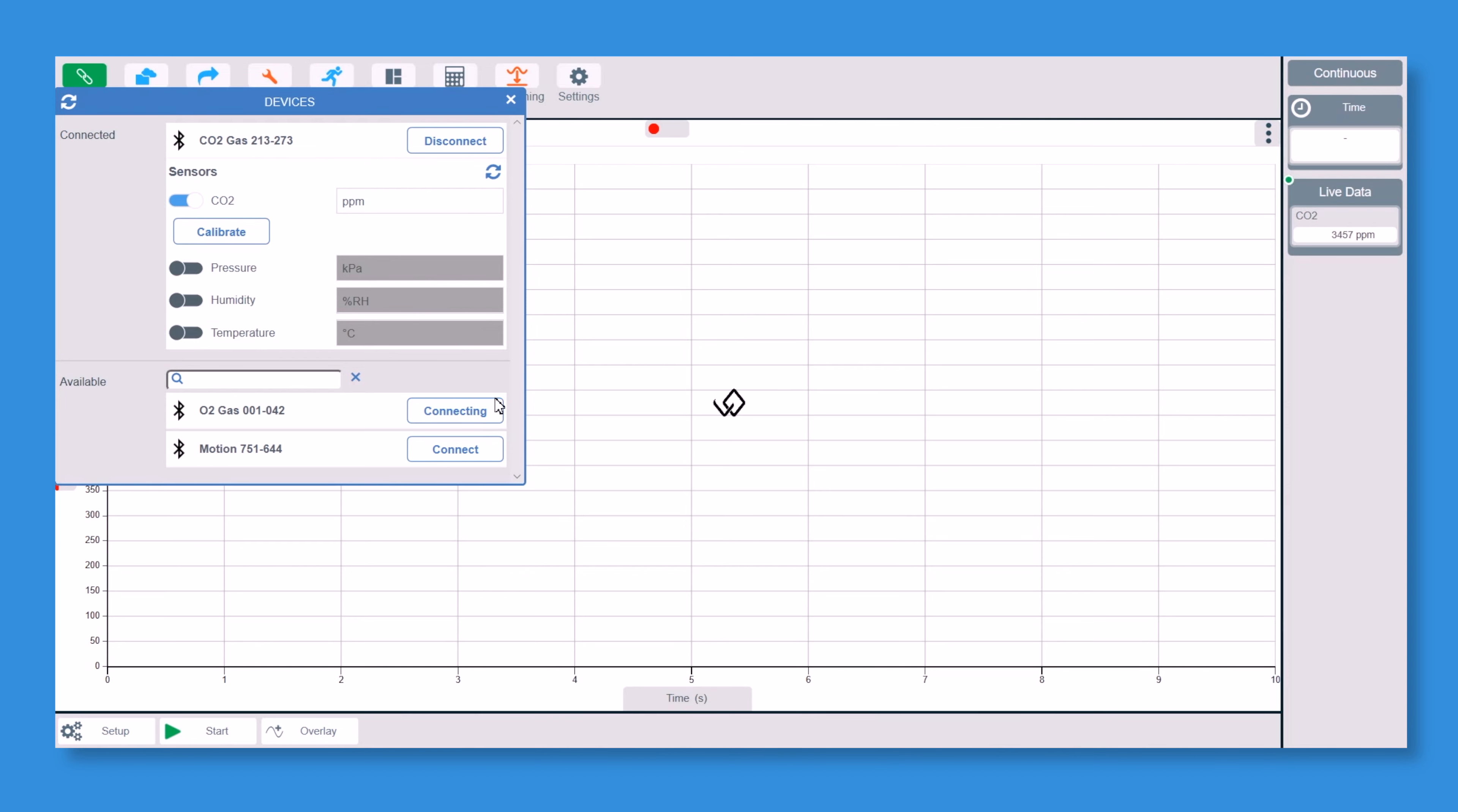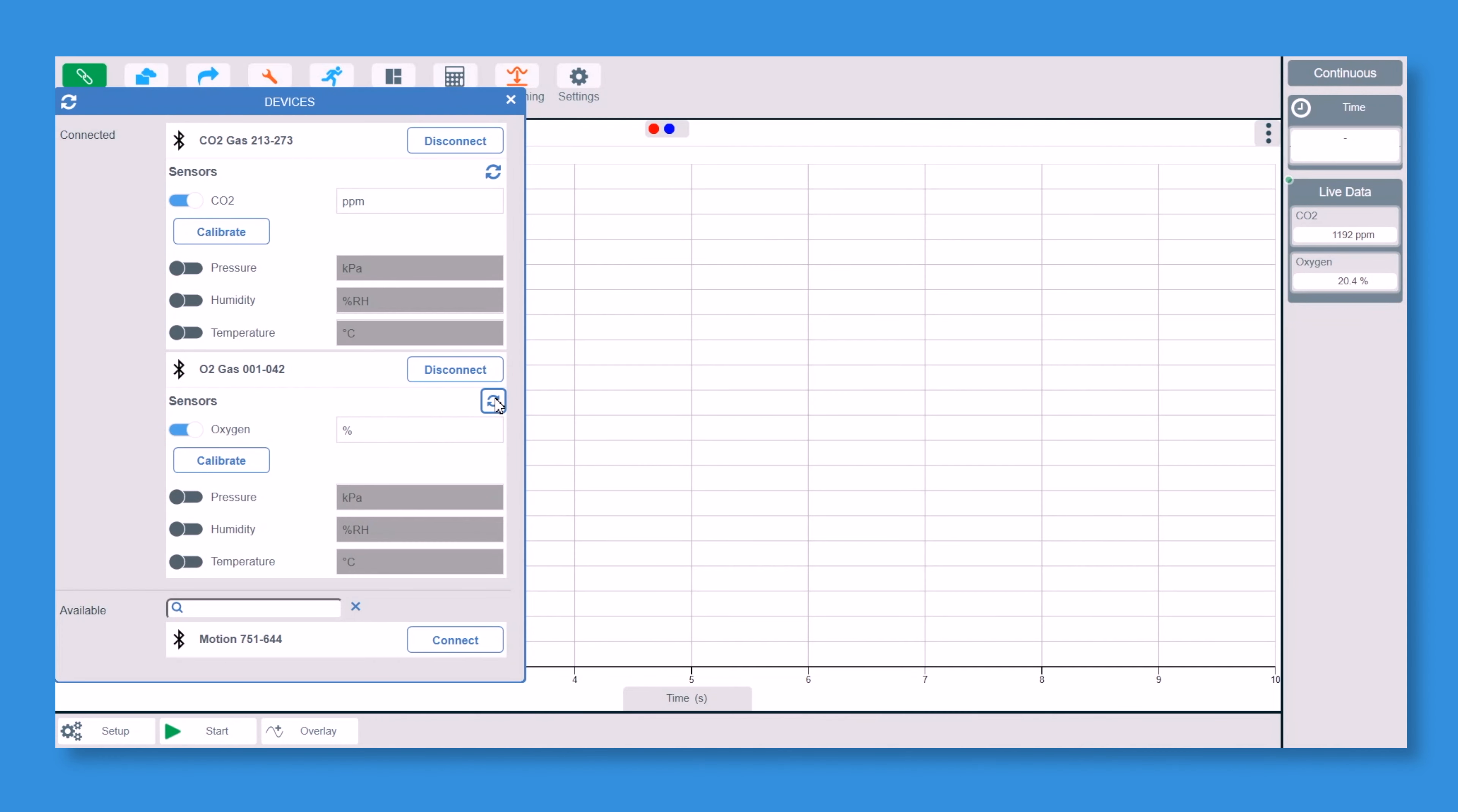Now because there's pressure, temperature and humidity in both, we don't want double readings of those on the screen. So I'm just going to turn those on on one of them. So on the CO2, I just want humidity and I want temperature switched on as well.